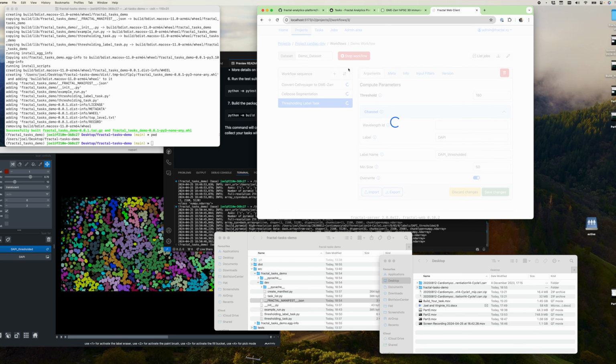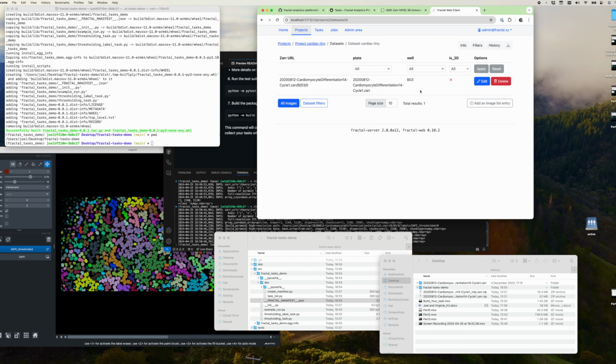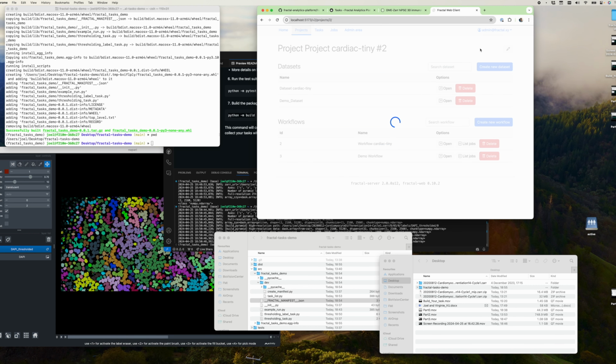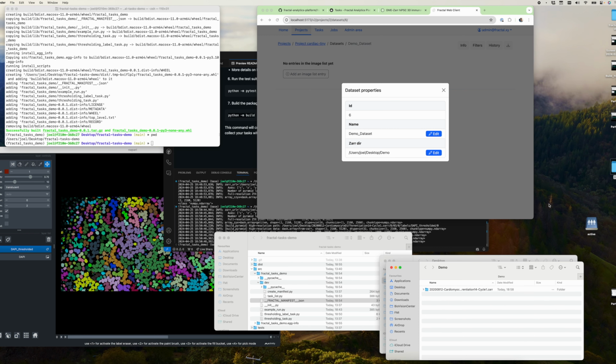Let's have a quick look on where I placed this. The demo dataset. Yes, on my desktop in the folder called demo.